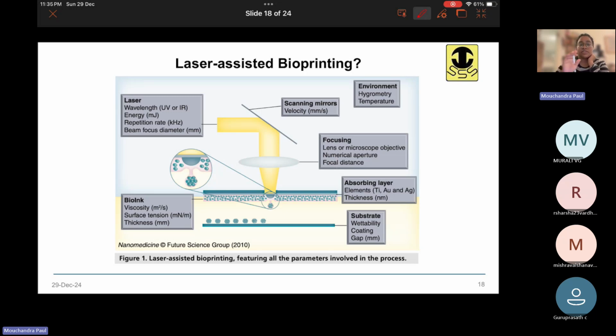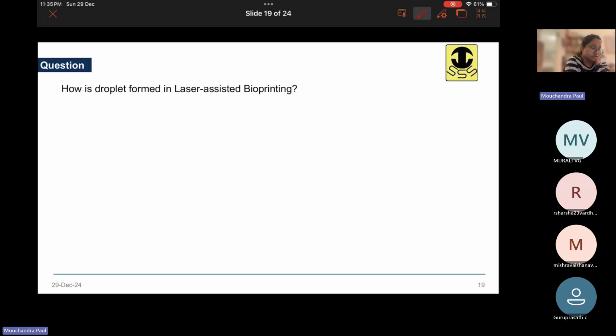This sweet spot we have defined using a parameter called gamma, if you remember. That gamma was basically defined as H over R max. R max is the maximum radius of this vapor bubble, after which it will burst.